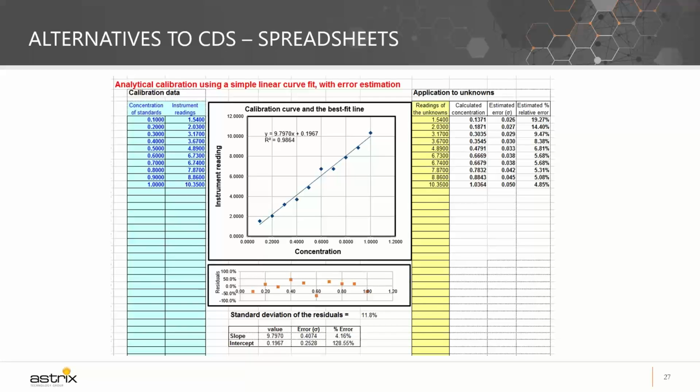One way of working with spreadsheets without relying only on Excel, giving a coat of protection over that, is that some LIMS and ELN systems permit analysts to embed spreadsheets within the system to overcome the security limitations and missing audit trail capabilities of desktop spreadsheets. So if there's no other way around spreadsheets and they need to be used, this approach of embedding your spreadsheets and putting intelligence over that and bringing that into an ELN and LIMS to give you the added layer of security would be the preferable way to deploy them.